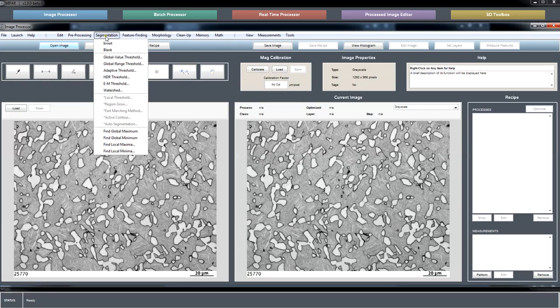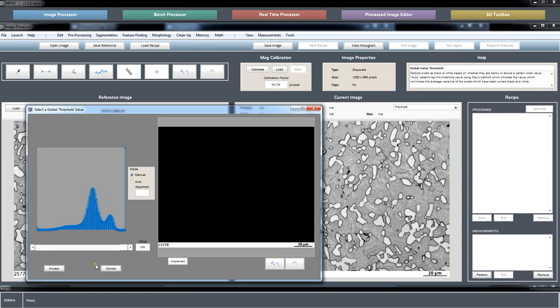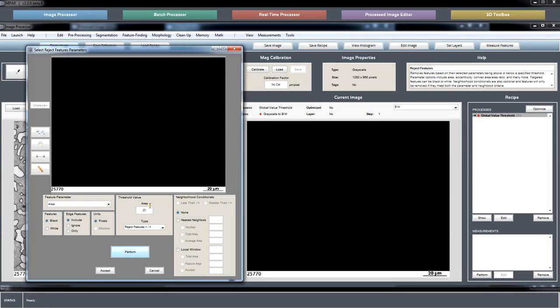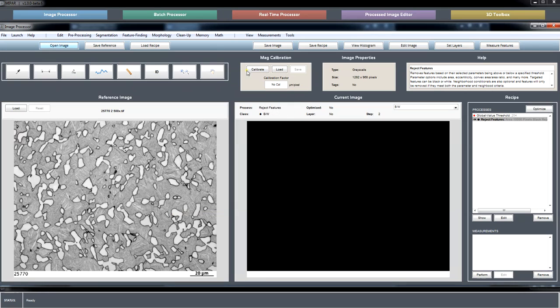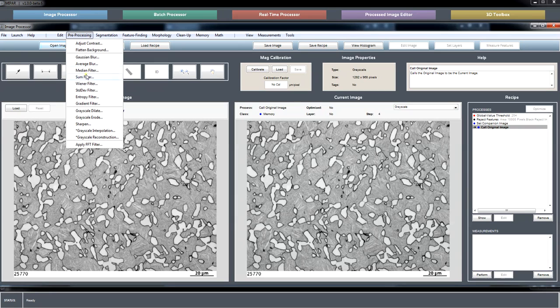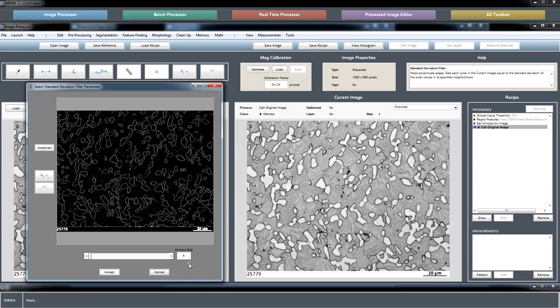I think if I just ran, again, if we want to keep the micron bar and don't want to crop it, we have these preliminary steps. And now off of this, I'll do a standard deviation filter, maybe with a window size of 5.